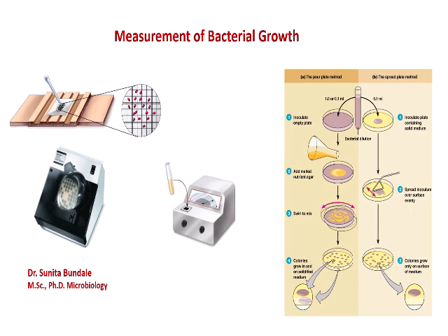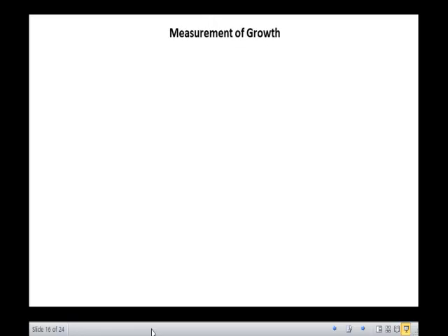In this module, we will talk about the measurement of bacterial growth. We will talk about the different methods which are used to count the number of cells, the number of colonies, and also the turbidometric measures to measure the cell density.